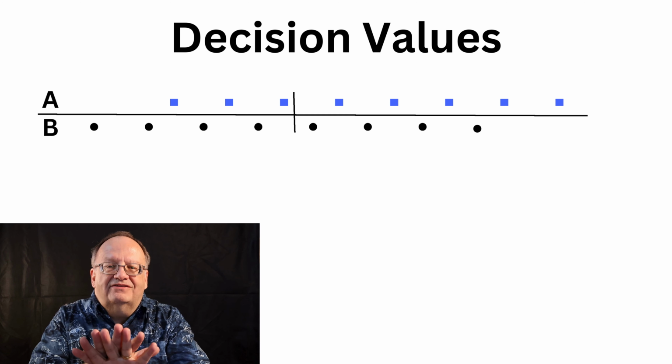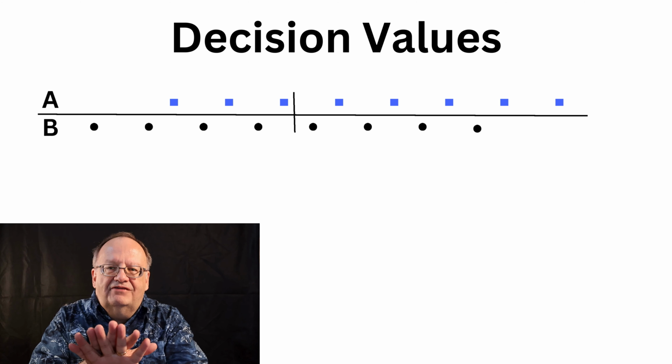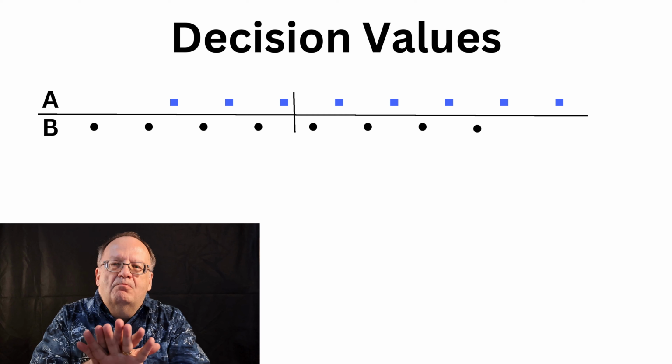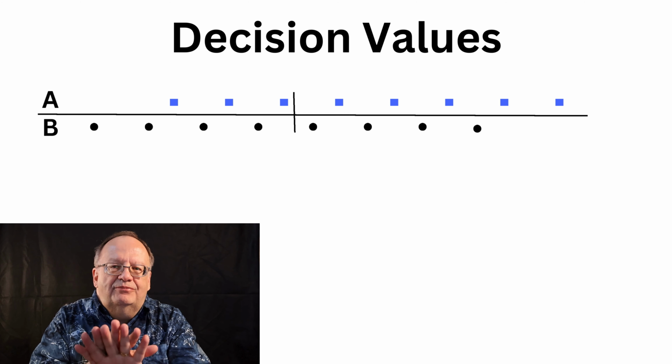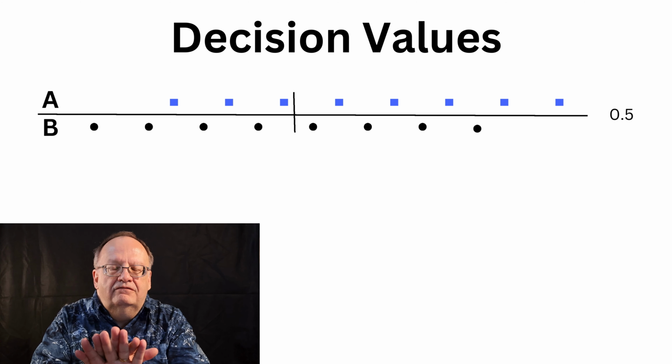This data point will tell us almost nothing about our problem because the A's and the B's are all mushed in together. This is 99.99% of all of your data points, because most of what you're going to see in a blood sample, tissue sample, etc. are molecules of ordinary housekeeping. That's the vast majority, because if it isn't, you're dead.